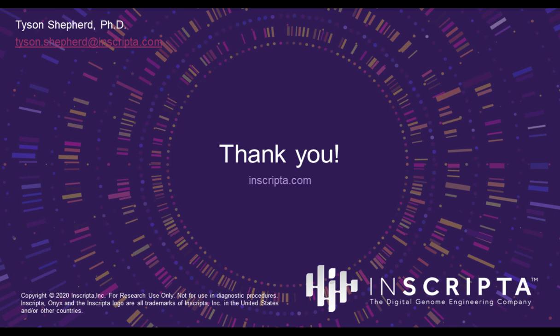What you'll receive when you order a library is a set of components that you'll plug into the instrument, and the instrument takes care of all of the cell handling itself, such that you put in these components and press the start button. I'm overgeneralizing here, but it then automates the entire process and workflow for growing out, making those edits, growing out, and then you'll receive a test tube back with a library of those edits in the actual cell culture. But the barcodes themselves are distinct and separate from the genome. They're off the genome and can be tracked for subsequent sequencing.